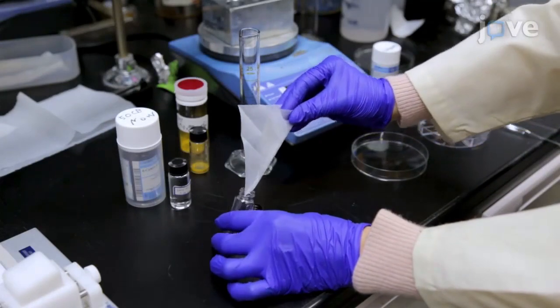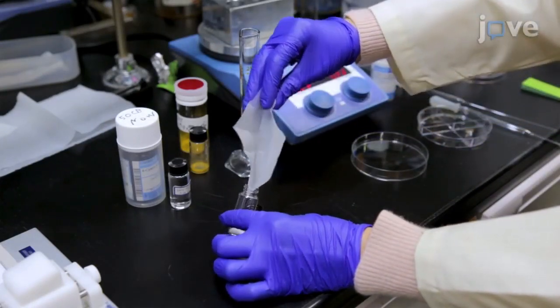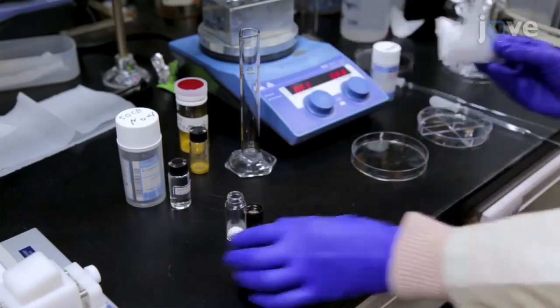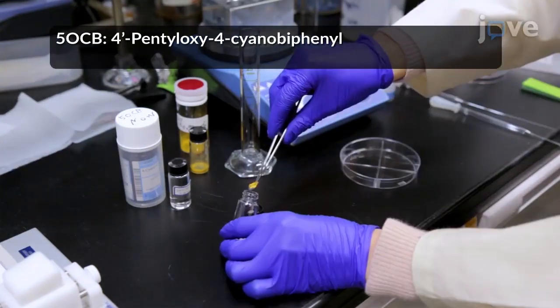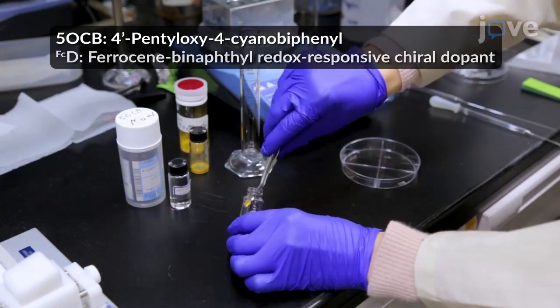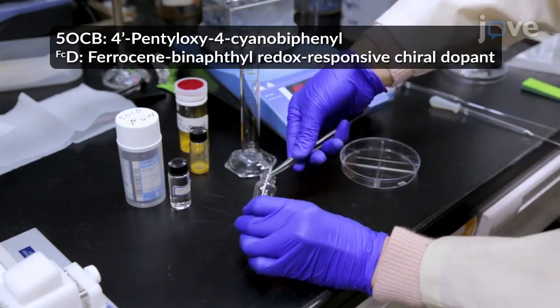To begin preparing the cholesteric liquid crystal mixture, place 84.6 mg of 5-OCB and 5.922 mg of FCD in a 10 ml glass vial.